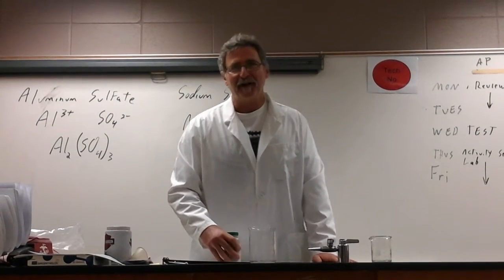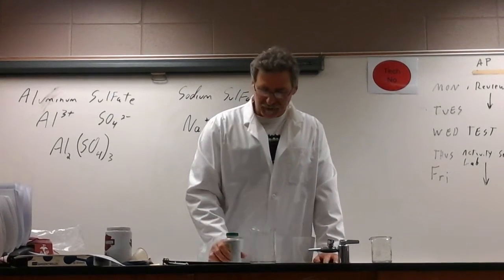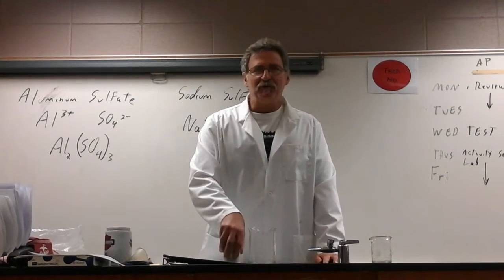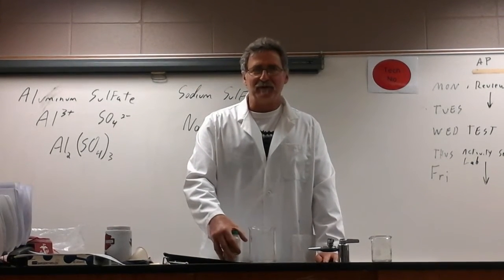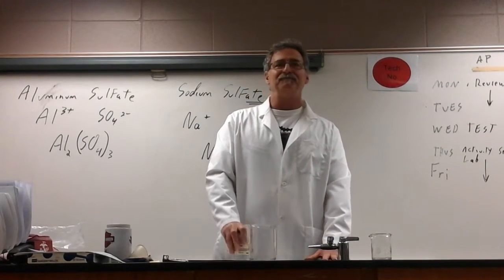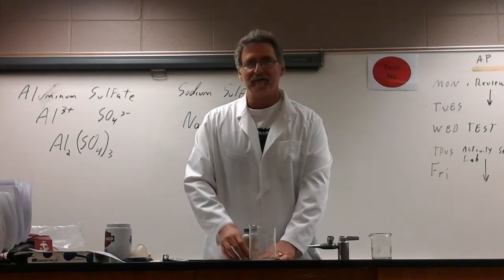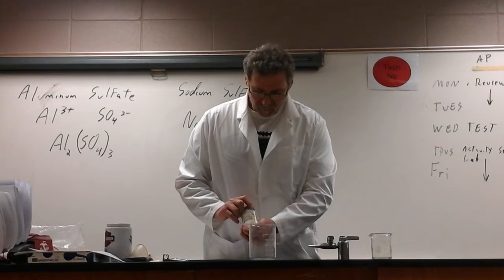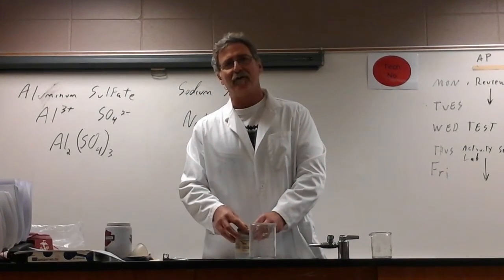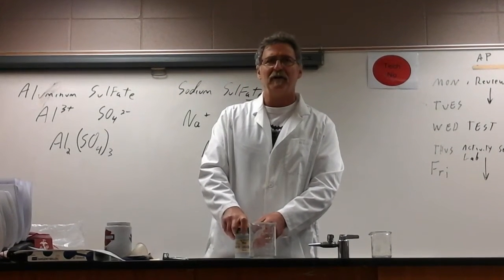Okay, we're back in Mr. Chem's lab, and today we're going to take a look at mercury. Mercury is a fascinating element, and a lot of students are never actually going to be able to see some of these demonstrations that I used to do years ago because of its toxicity. It's been eradicated in a lot of public school chemistry labs. Now, unfortunately, there's nothing that I have found that better demonstrates certain concepts, density in particular, than mercury.